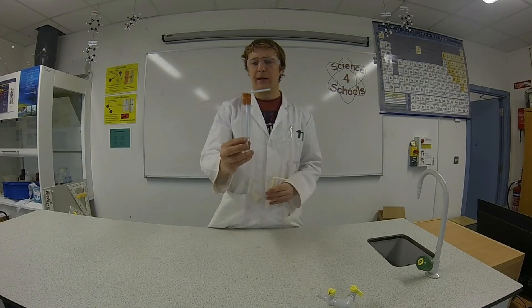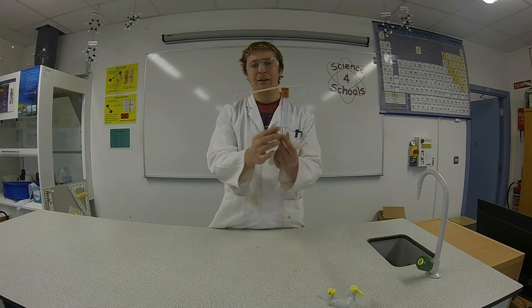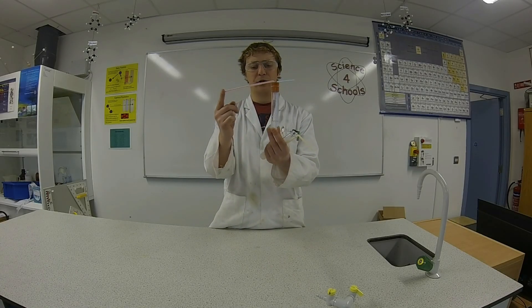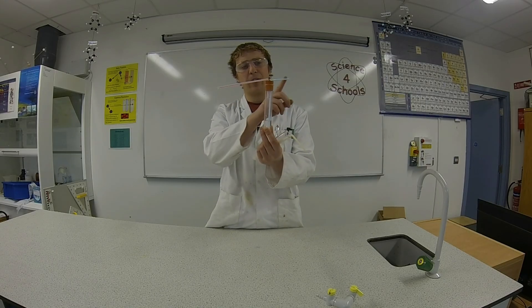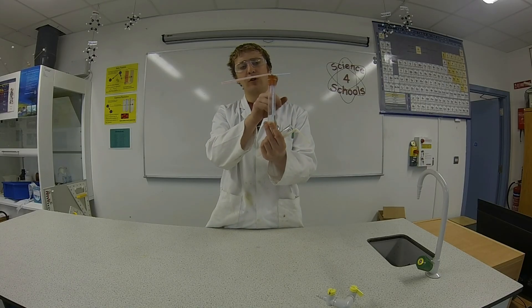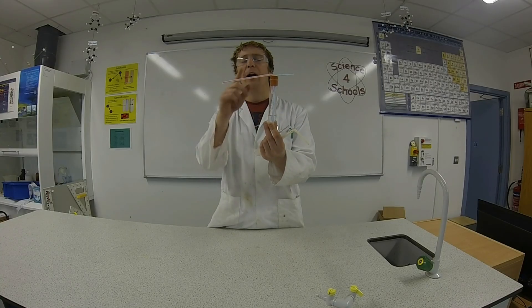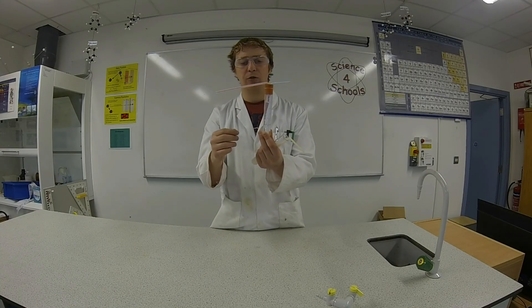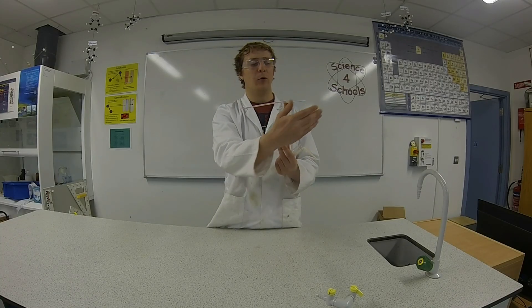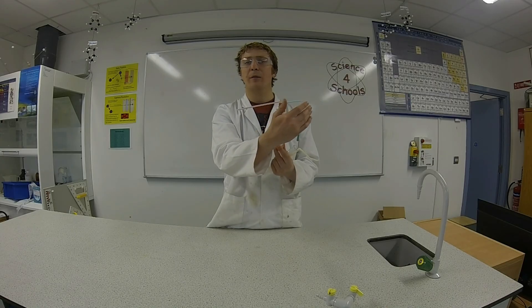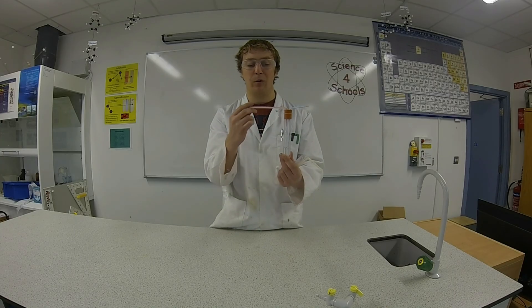For this test tube I'm going to inhale into the red straw. That's going to draw the air through the blue straw, down through the lime water, and up out the red straw. That should mean that only air from outside will pass through the lime water.